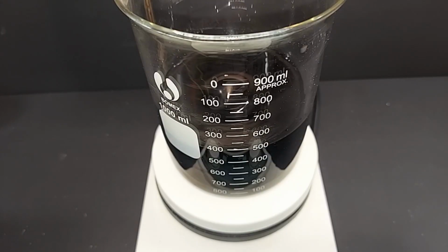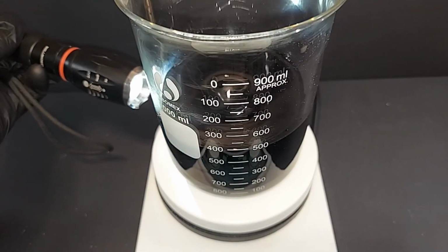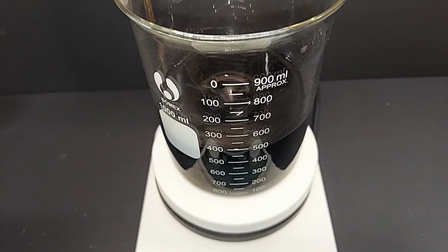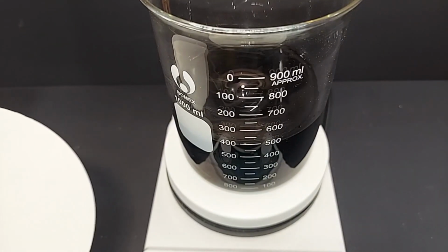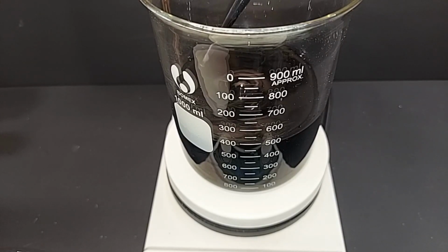Right now, this is supposed to be sort of a greenish color, but it's not. It's kind of a brownish green color, and I noticed when I put a flashlight on the other side here, you can't see through this stuff at all. So it's pretty dense. Seems kind of concentrated, so I'm going to take a little bit out and we'll take a peek at what it looks like. I have a piece of filter paper right here and a small plastic pipette, so I'm just going to draw up a tiny bit here.